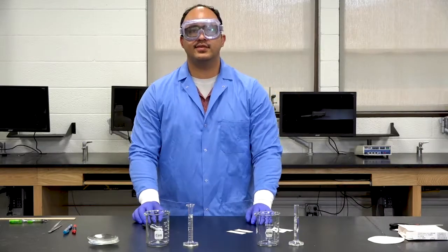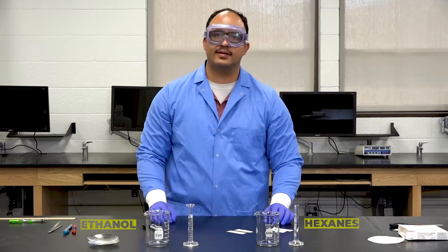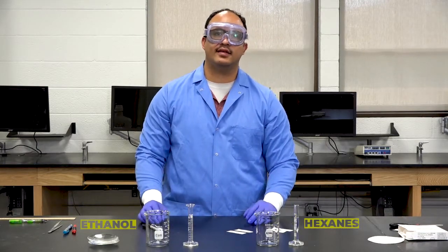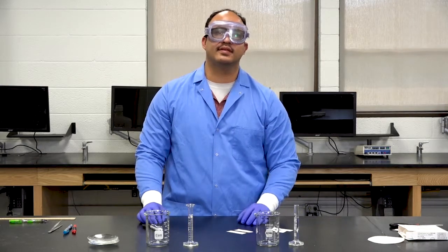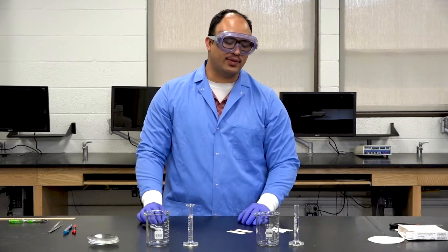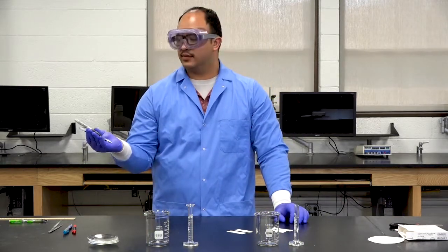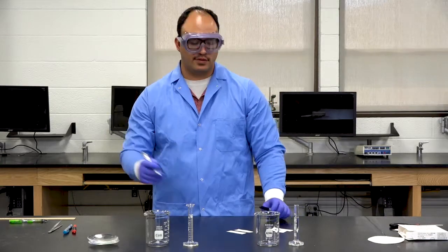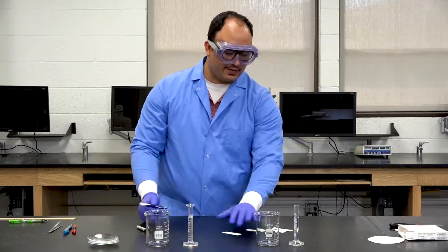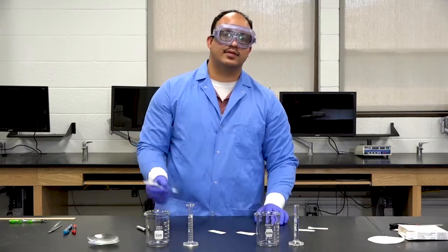All right, for this demonstration, we're going to be using ethanol and hexanes because the polarity between these two is very, very different. Ethanol is an extremely polar solvent, and hexanes is very non-polar. So we're going to do a quick demonstration using 2 different ink sources. We have a permanent marker and an oil-based pen. So it's going to be really easy to mark the spots using the pen.